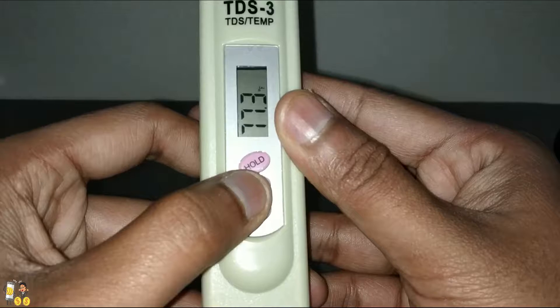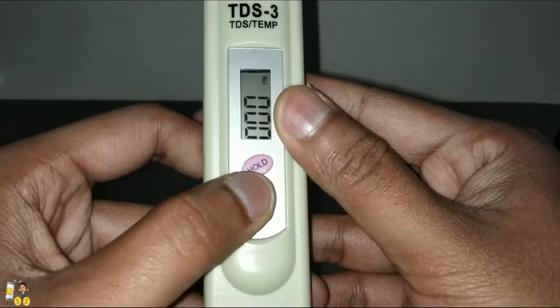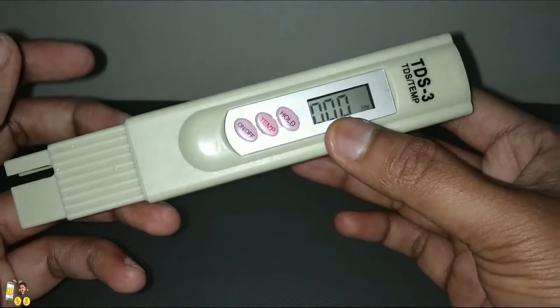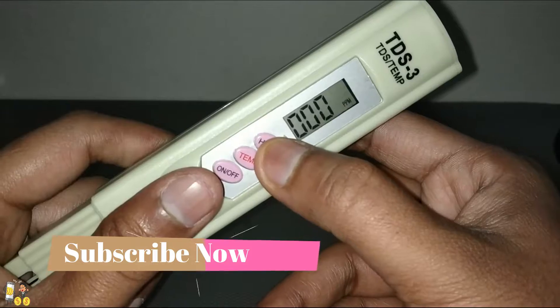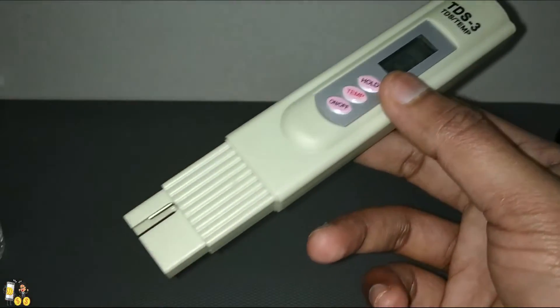When you tap on it again, it shows the temperature in Fahrenheit as well. When you tap again, it shows the PPM levels, which is currently 000. If you want to hold or save the reading, you can just press and hold the button.